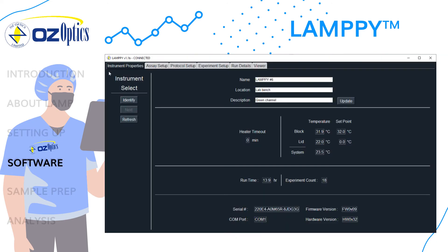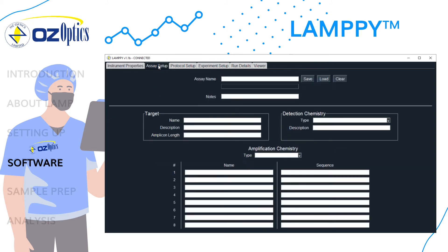On the instrument's property tabs, you can see whether or not an instrument has been detected and connected, the instrument information, and choose which instrument to connect to if multiple instruments are linked to a single computer. On the assay setup tab, you can input information about the assay, save it, or load and save assays. It is optional to input this information, but highly recommended for reproducibility.